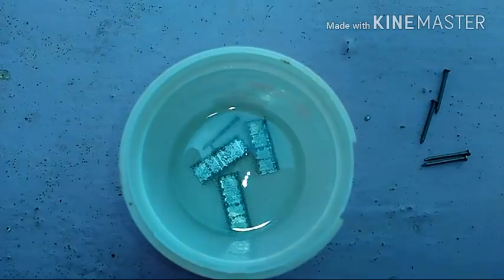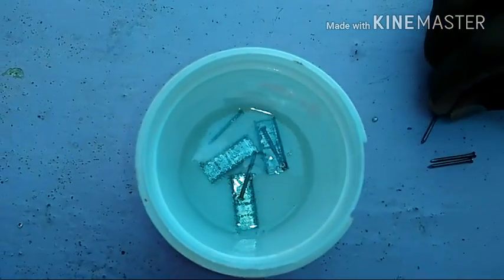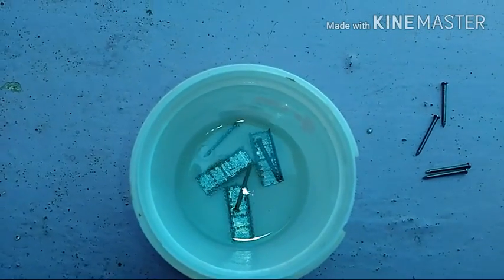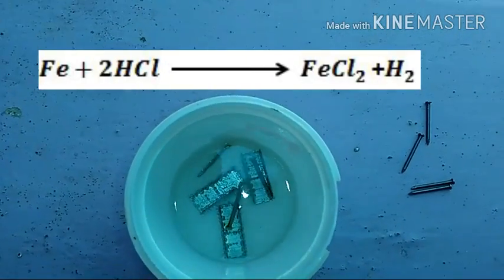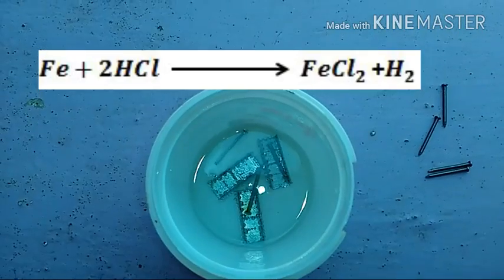When we add iron pieces into the hydrochloric acid, iron reacts with hydrochloric acid and liberates hydrogen gas, forming ferrous chloride solution, FeCl2.